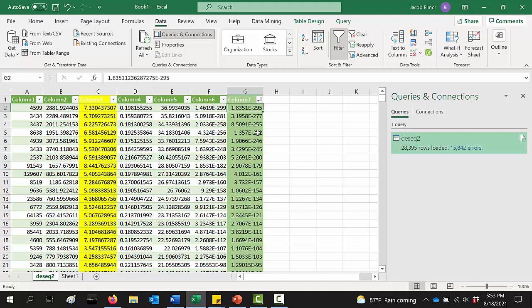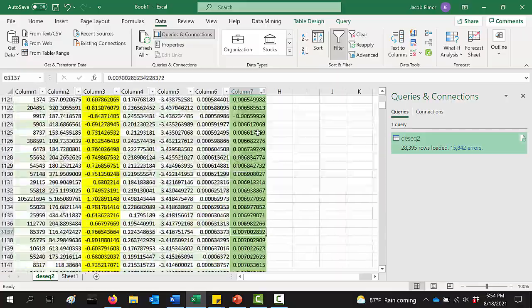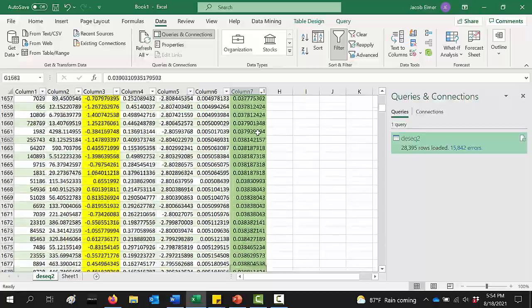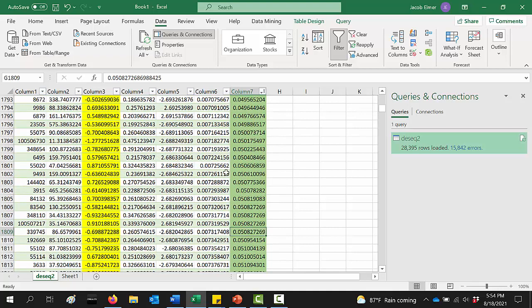And so a low p-value indicates that it is, a higher value indicates that it's not. Specifically here, we're defining that threshold as p less than 0.05, indicating significance. So these are really small numbers. I'm going to go down quite a ways here. Here we go. Almost there. Right about there. There it is.